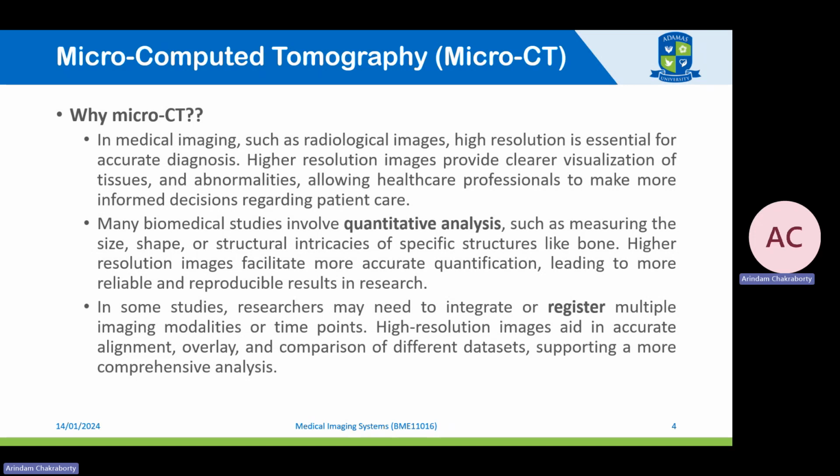So here, this high resolution of micro-CT can facilitate an accurate alignment, whereby stacking those images at different time frames or from different imaging modalities can be useful for comparing and understanding the effect in a very comprehensive way, or to understand the changes in the internal structures in a very detailed manner.